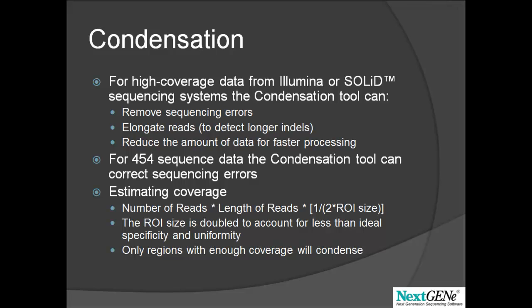It is important that there is sufficient coverage. Reads from an area with too little coverage will be saved in a separate file. 30x coverage is close to the minimum coverage necessary, but over 100x is suggested.